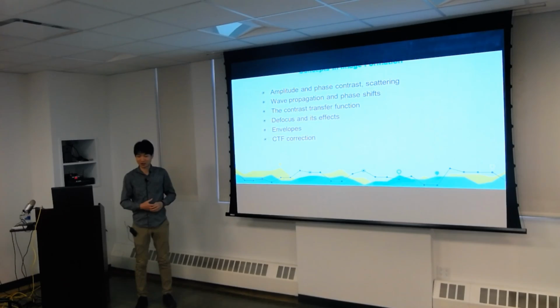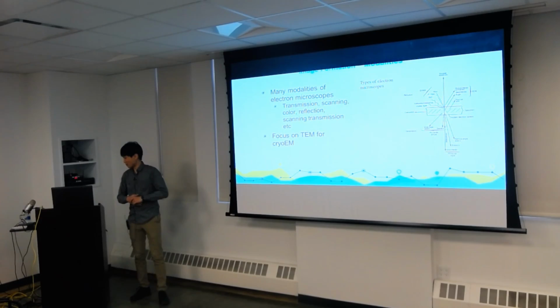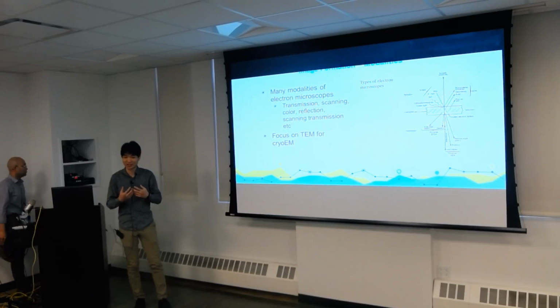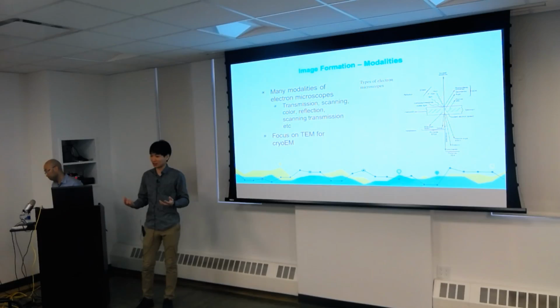Okay, so image formation itself in electron microscopy has quite many modalities. Grant has briefly touched on it in his talk, and I find it really nice to see that when you put an electron through your sample, there are many, many things that can be emitted and actually observed. And what we are doing in transmission electron microscopy, specifically single particle, is only touching on just one aspect of the emissions that come out from observing your sample.